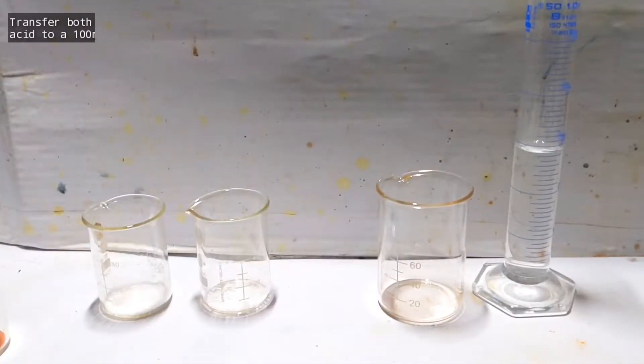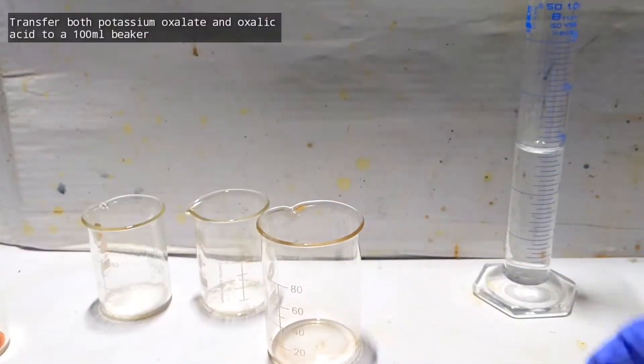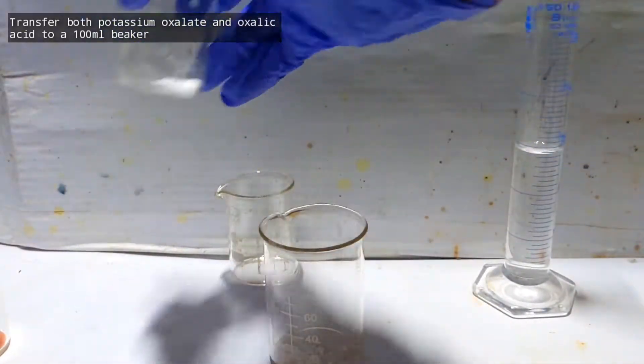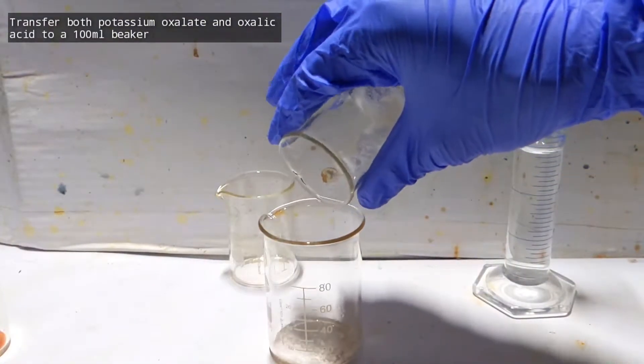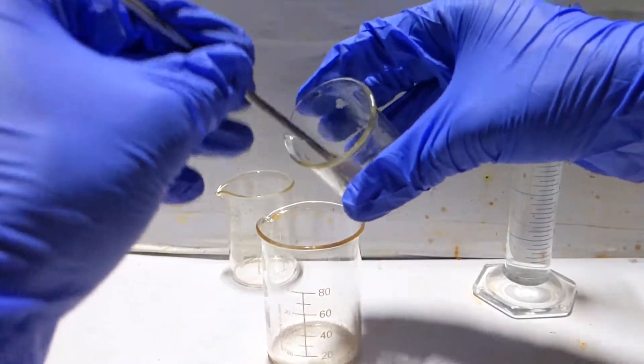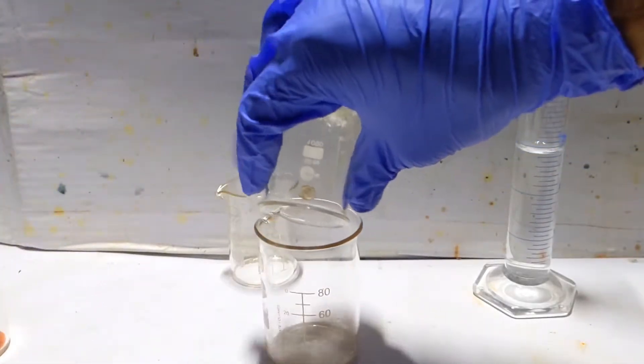Take a 100 milliliter beaker and transfer both the 1 gram potassium oxalate and 2.5 grams of oxalic acid to it. Oxalic acid got stuck on the walls of the beaker, so a spatula was used to transfer it completely.